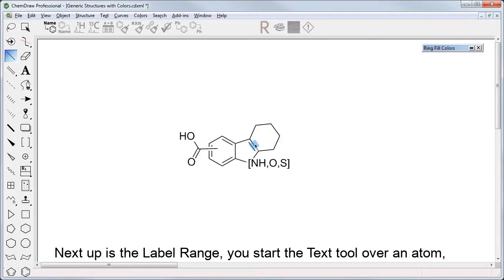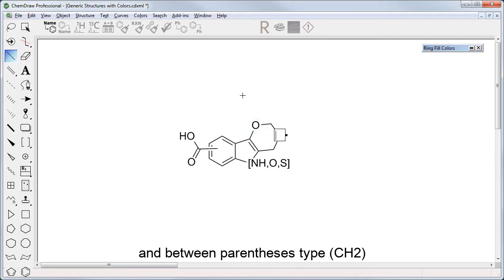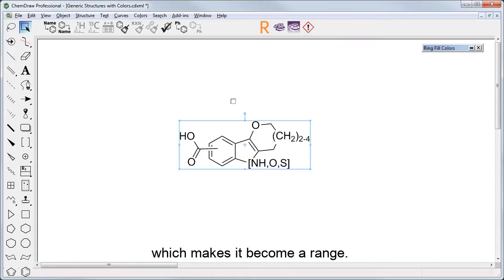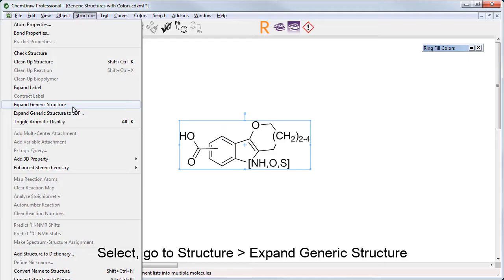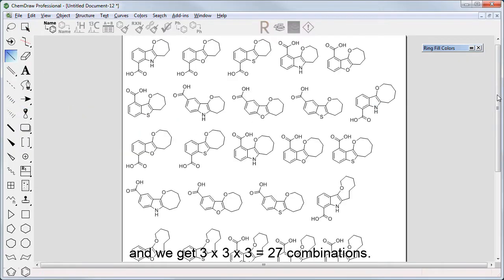Next up is the label range. You start the text tool over an atom, and between parentheses you type CH2, followed by 2, hyphen, and 4, which makes it become a range. Select, go to Structure, Expand Generic Structure, and we get 27 combinations.